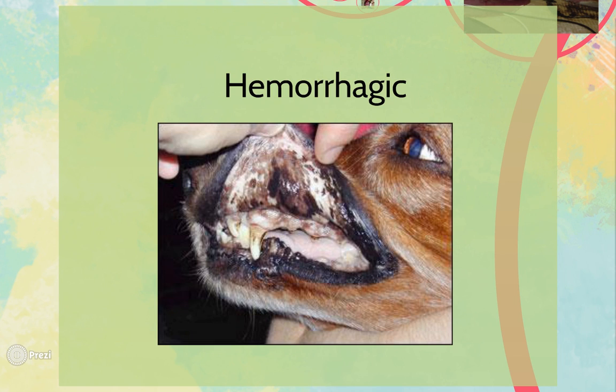And the vet has to determine if it's a constant hemorrhage that's currently occurring from an organ or a vessel, in which they might see platelets, or if it's one that's typically caused by a tumor or cancer or a rupture of a tumor or cancer. And in that case, typically there aren't platelets or an extremely low number of platelets in the fluid.